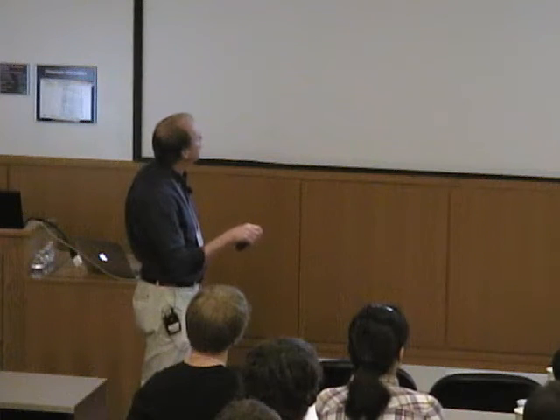And so here are a series of spectra of single crystals of photosystem 1 taken at different orientations, and you can see that the shape of the EPR spectra changes as we change the orientation. Here it's a little bit complicated because we have two iron-sulfur clusters, and then there are 6 molecules within the unit cell, so for some orientations we have quite a number of lines that we have to sort out. Right? And so if we plot all of those line positions, we get this somewhat onerous-looking graph, but with a little bit of effort, each of the patterns can be fitted.